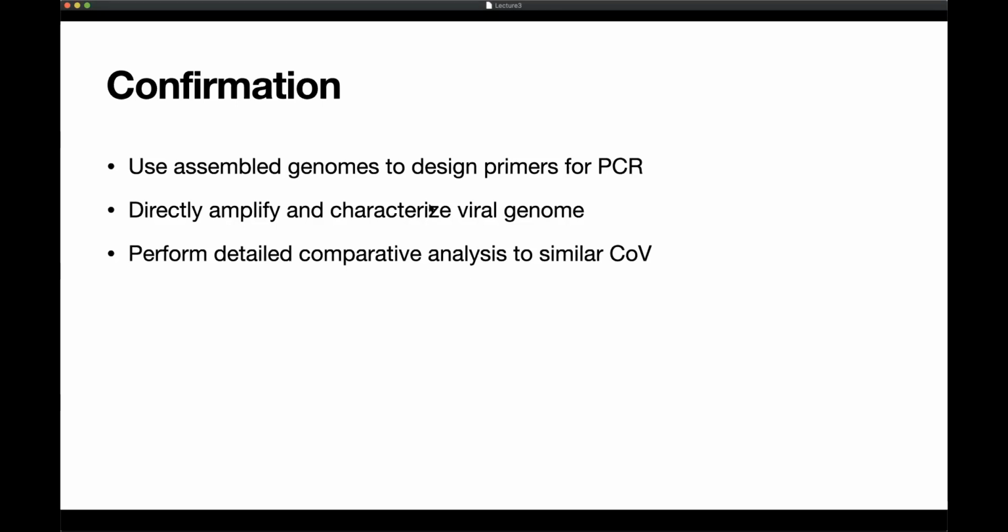Right? Because you could also have a computational chimera. You could have a software product that doesn't exist in nature just because the reads were not assembled properly. All right, but this is a very, very important first step. Once you have a reference genome, it enables all kinds of other things like resequencing and molecular diagnostics, which is where we're going to go next.